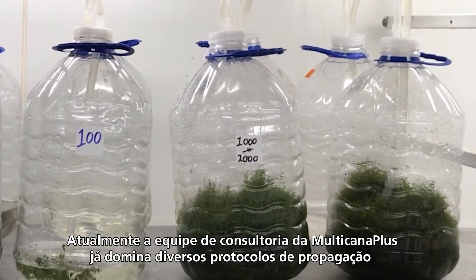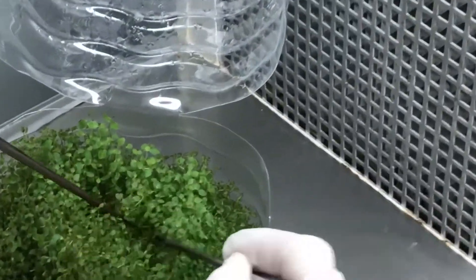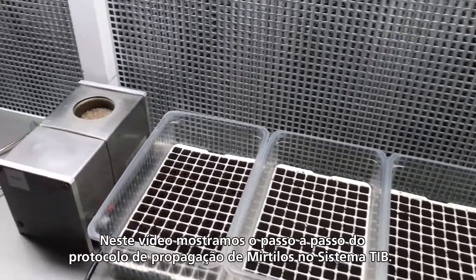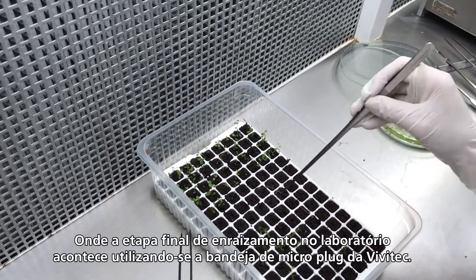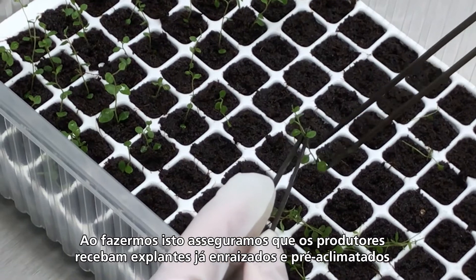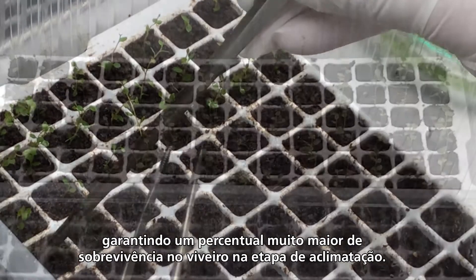Multicana Plus Consultancy team already masters several propagation protocols via temporary immersion in bioreactor system, also known as TIB system. In this video we show you the step by step of the Blueberry propagation protocol in TIB, where the final rooting phase in the lab is done by using the Vivitec microplug tray. By doing this we deliver to the grower a plantlet already rooted and pre-hardened, which ensures a greater survival rate of the plantlets in the greenhouse during the hardening phase.